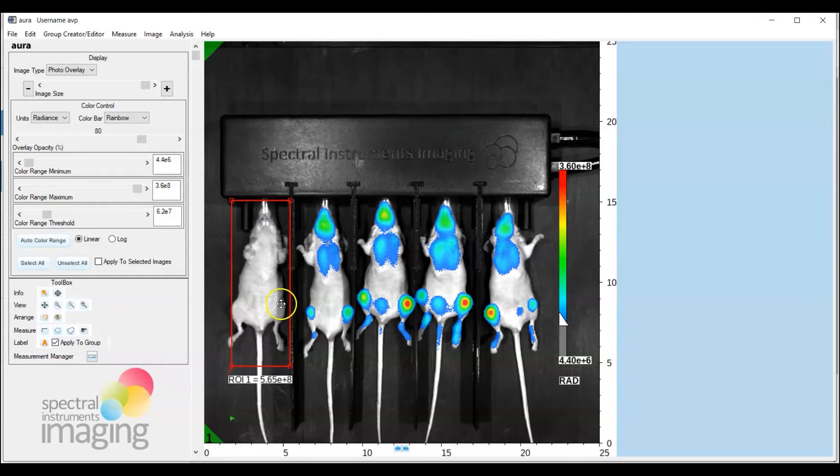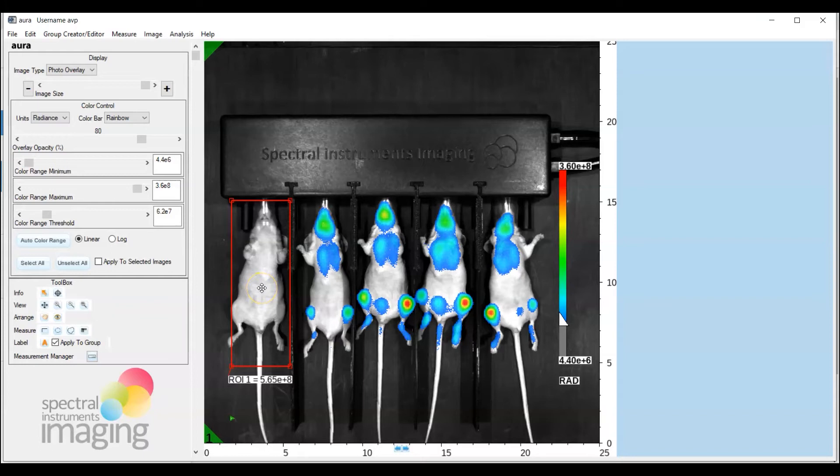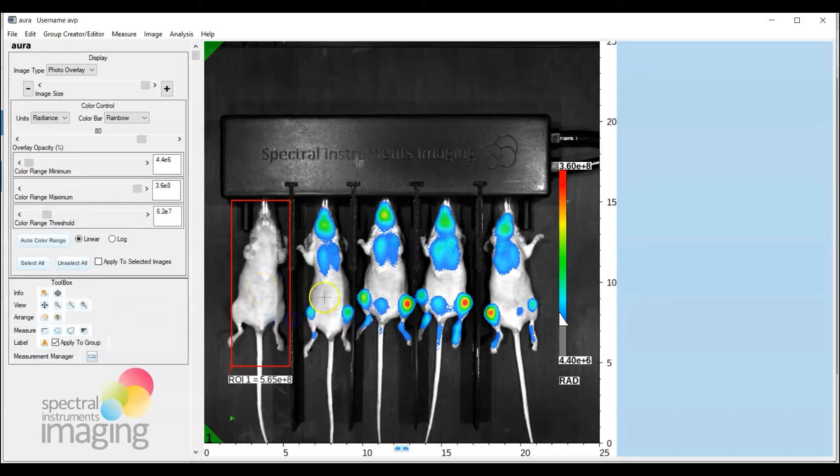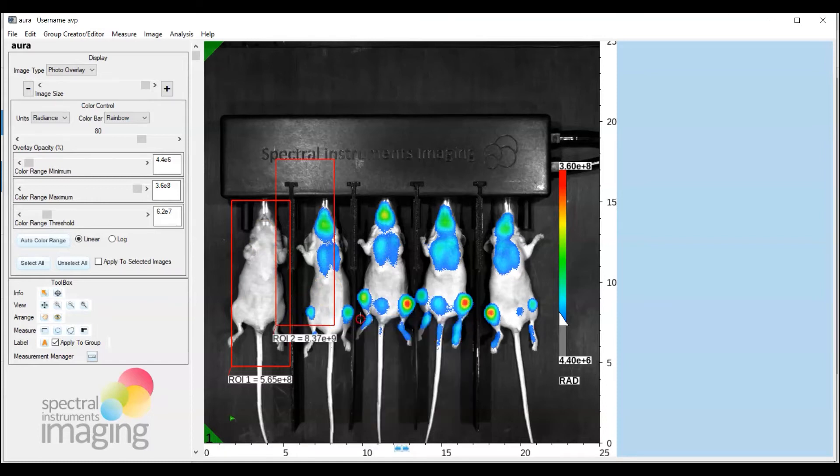All right now we're going to go ahead and copy paste this ROI across and capture the data from the test mice so what you do now is again it's in an active state so you right mouse click copy outside of the ROI paste ROI and just repeat that.